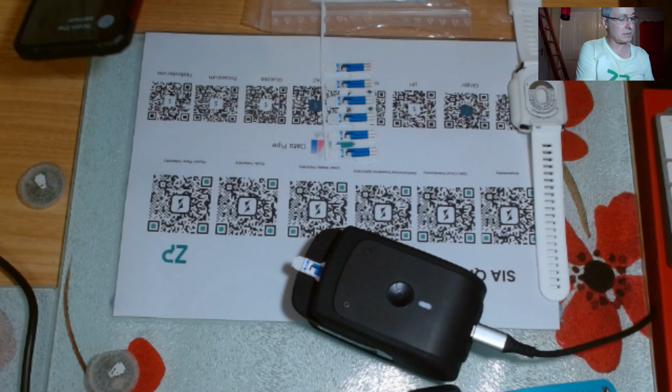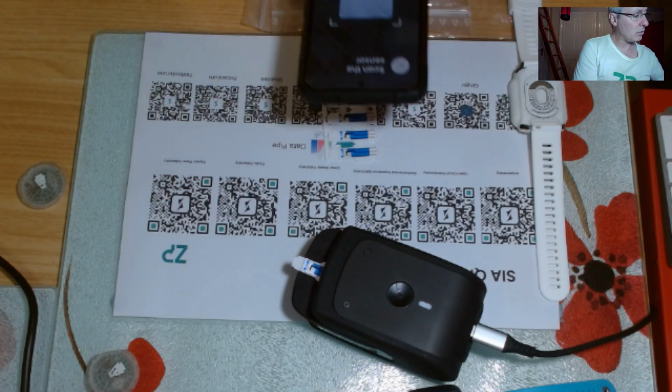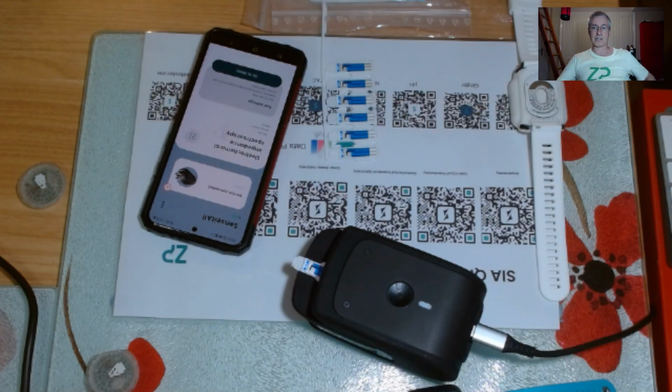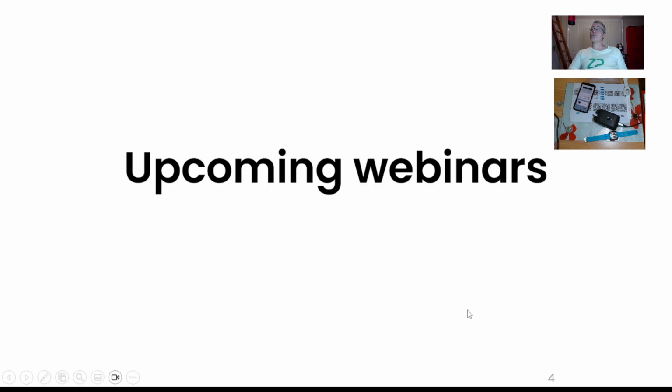So if they're going to do immunoassays, square wave voltammetry is a good technique. If they're also doing EIS, electrochemical impedance spectroscopy, that would also be a good technique as well.